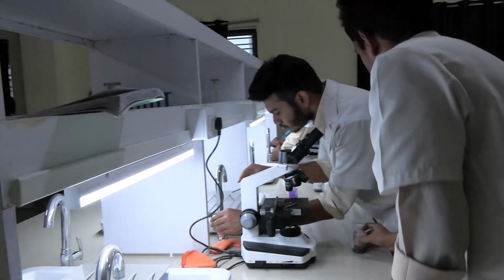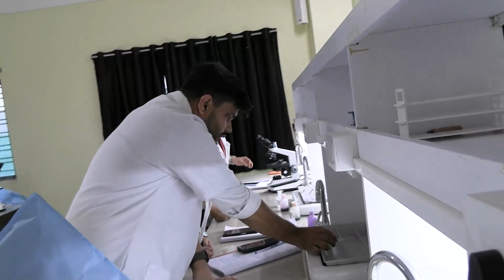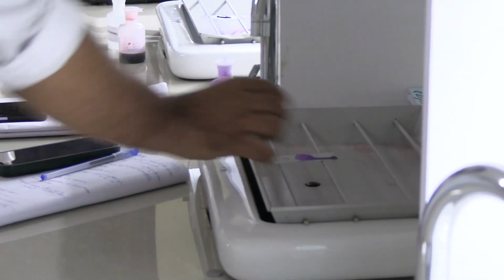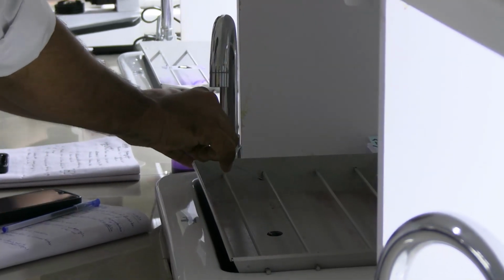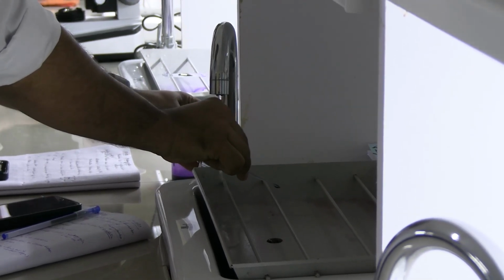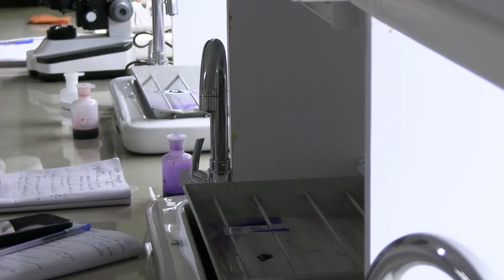Okay. So pass on to the Mordant. So remember, you're gonna hold it like this, okay? See? Why are you guys taking the long way route, then holding here, okay? You're gonna just hold it from here. You're gonna take it here, okay? Open the tap a little bit, okay? See? That's enough, okay?